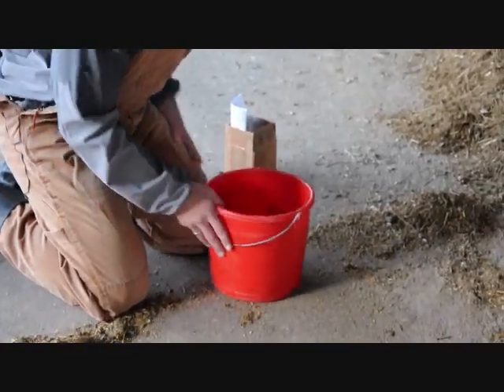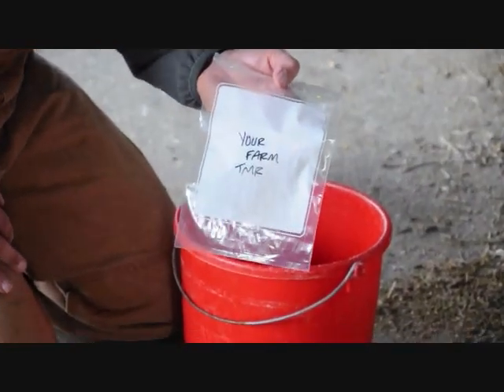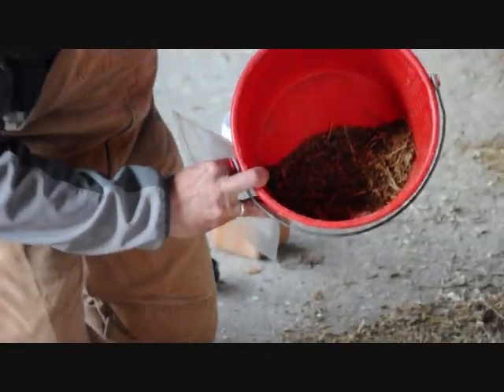You see, nothing left. And then here's going to be a sample bag. I pre-labeled the sample bags with your farm name and then just simply 'TMR' for a sample identification. This is about what we have left.